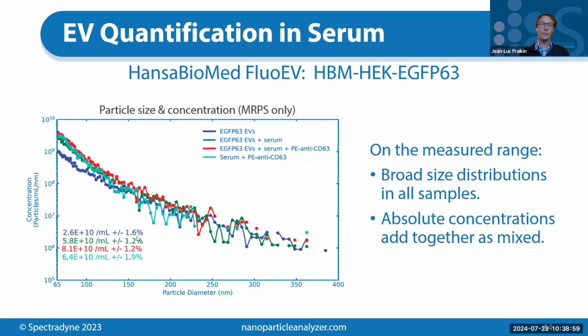This is really a fundamental unit that makes it more translatable from one measurement to another, and less susceptible to user choices about binning. You can rebin the data as you like and display the data as you like in our software. And you can also measure these concentrations over any range just by click and drag with the mouse, or in some canned reports that we have available in the software. So it's very straightforward. No problem, Maggie. Thanks for the good question.